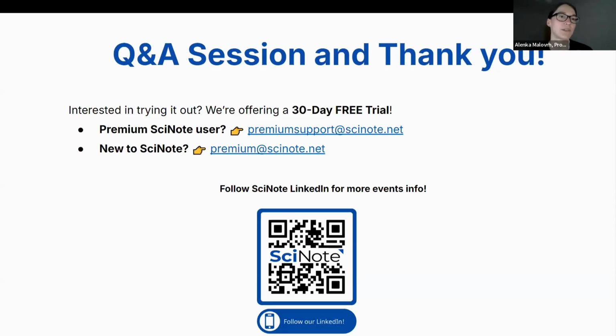So it's kept there. It's only in the, let's say, view mode. So it's a read-only state. You can't edit it anymore when the trial is over. And Alenka, this information is also retained in the audit trail, correct? Even after the free trial period? That is correct, yeah.